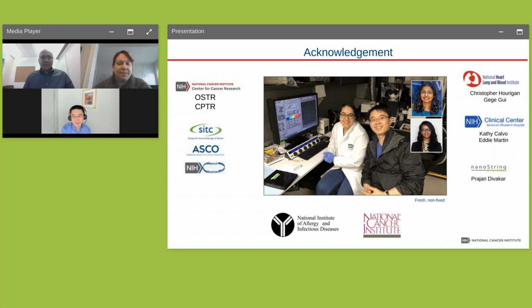All right. Thank you for that, Dr. Zhao. We have another question for Vic. Can you elaborate on some of the applications of CosMx SMI, specifically as it relates to the platform's multi-omics capabilities?